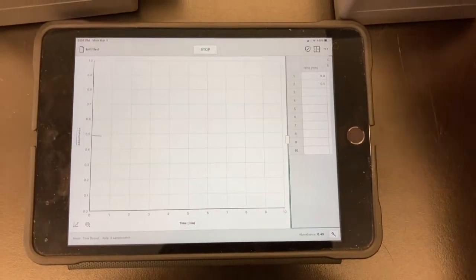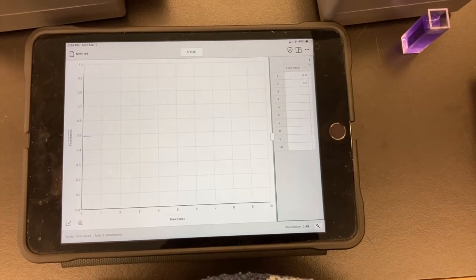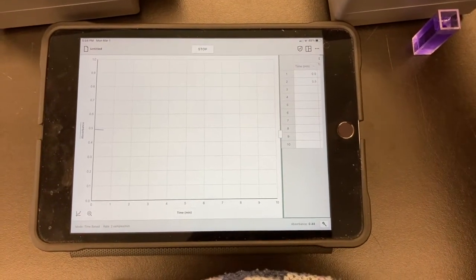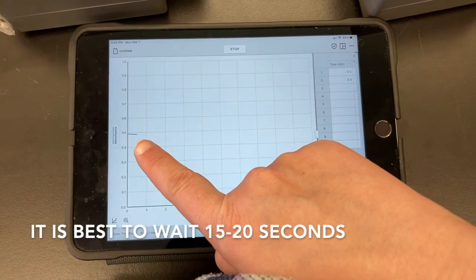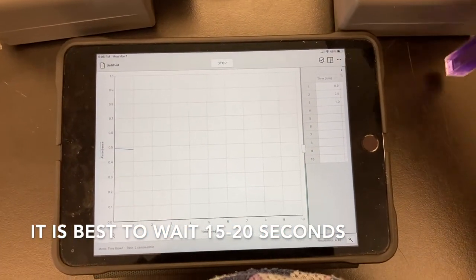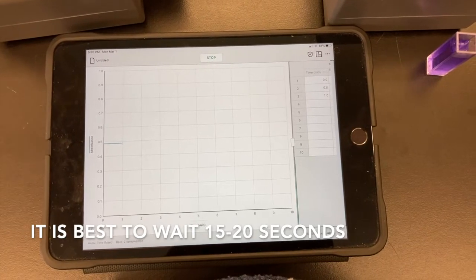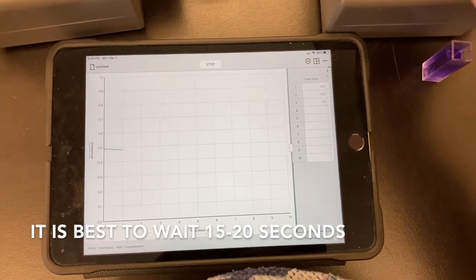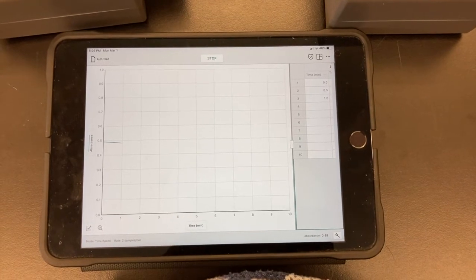When it appears, you are going to take out your cuvette and just let it out for a few seconds and then you will stick it back in so that it is there for the next reading. Now the first one, you probably don't want to put it out too long, but I just got one more data point. So now I have 30 seconds. So I am just going to count to 10 really slowly. And then I am going to put it back in so that it is ready for the next reading. And then I am going to watch the graph. And as soon as that graph goes over, I am going to pull it out again so that it doesn't get too warm. And then I am going to open it back up again and stick my cuvette back in. And I will continue this procedure for 20 minutes.